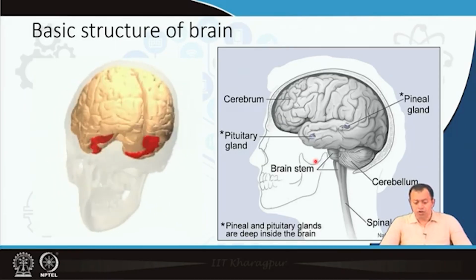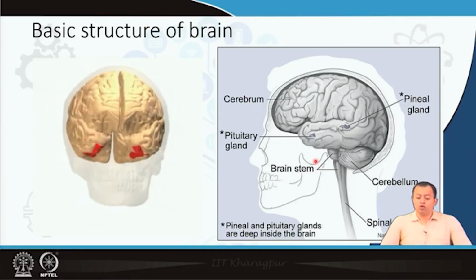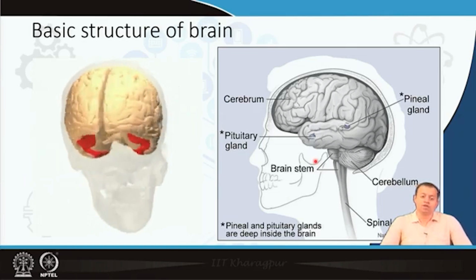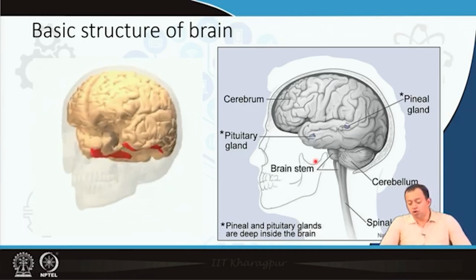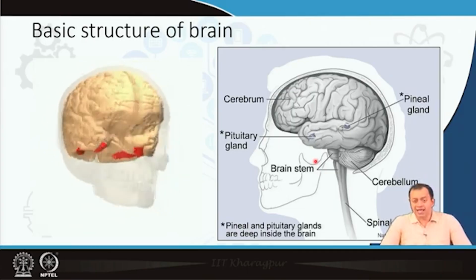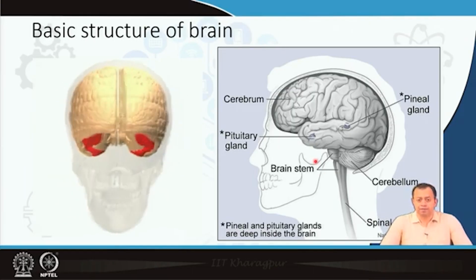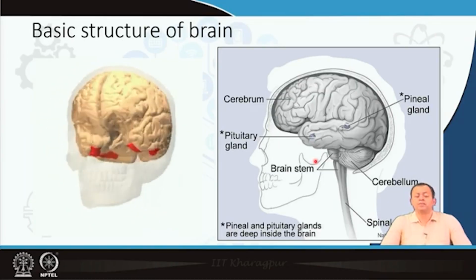So, we now want to image it. We now want to make a three-dimensional image. We want to see how each neuron is firing. We need to know how each individual neuron is working, both individually as well as in tandem with a group of neurons, and thereby connecting itself with several bodily functions.